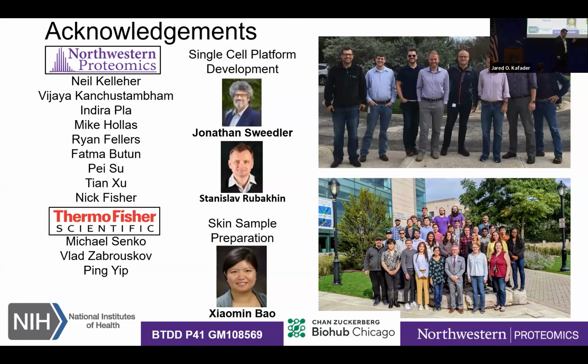Yeah, well, one of the biggest limitations that we have, of course, are the databases that we use and matching. With the intact mass tag approach, there's only so much you can do. We try to boost all of our identifications by taking the SAM data type and running top-down analysis or using previously determined bottom-up data sets. But having enough sensitivity to be able to do tandem mass spectrometry, to actually have the sample and then analyze what exactly those proteoforms would be, that would be amazing. We just don't have enough ion counts to be able to do fragmentation and correspond that back. But that would be the dream.